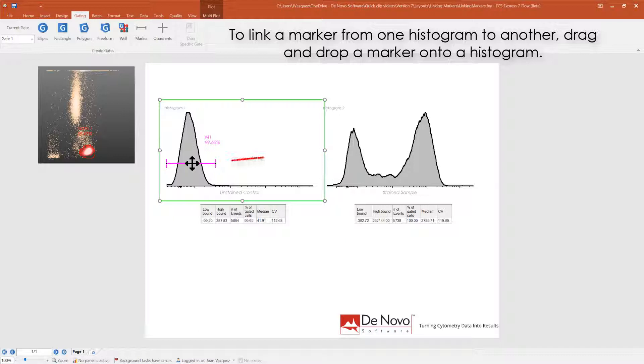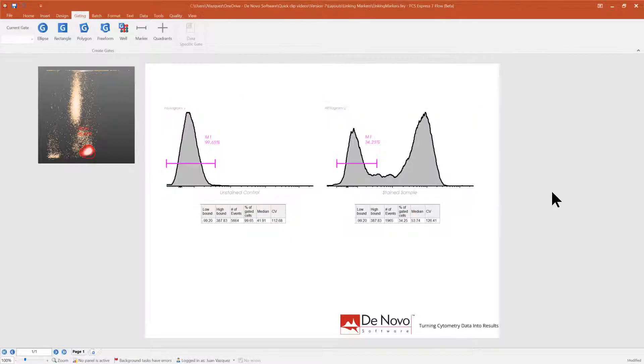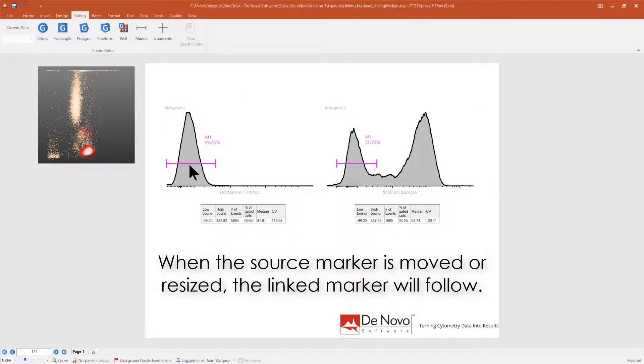To link a marker from one histogram to another, drag and drop a marker onto a histogram. When the source marker is moved or resized, the linked marker will follow.